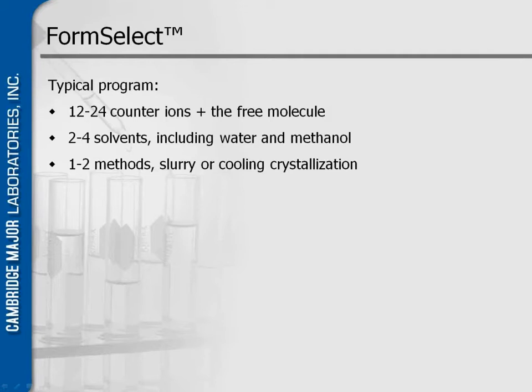When you look at which methods to use, well, 1 or 2 methods. If it is a very insoluble compound, you just go to slurry at different temperatures. When you have a choice of different solvents which you can use, then you have cooling crystallization, which most of the time improves the quality of your salt.